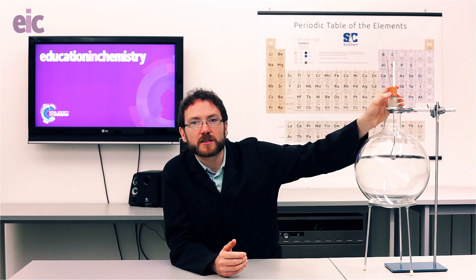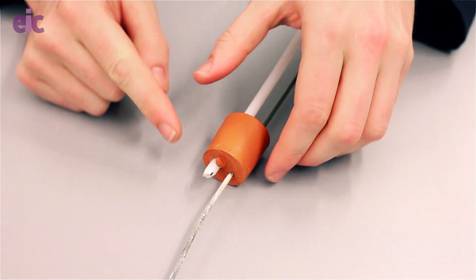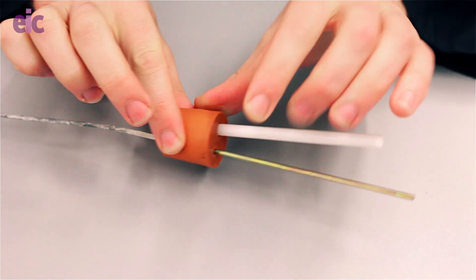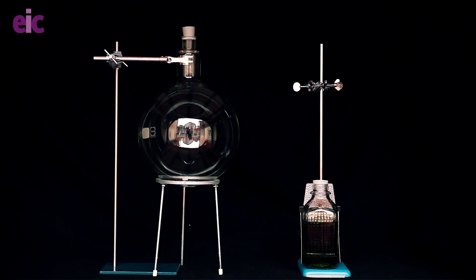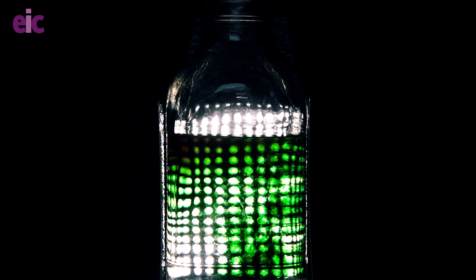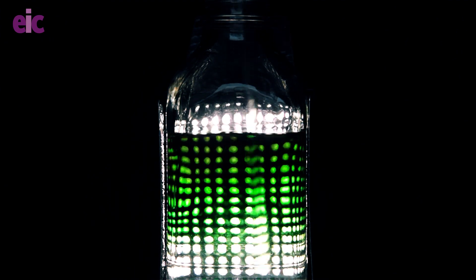I've bored a bung so that I can run my deflagrating spoon through, and a delivery tube — and that's going to be connected to some water, trapping any expelled gases. The water has an indicator so that if any gas does bubble out, we can see the effect it has on the pH.